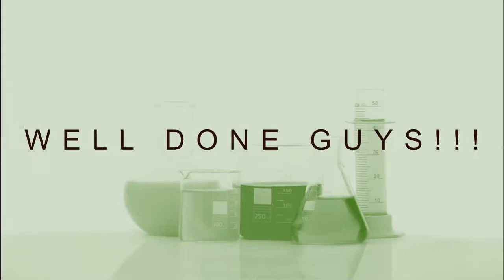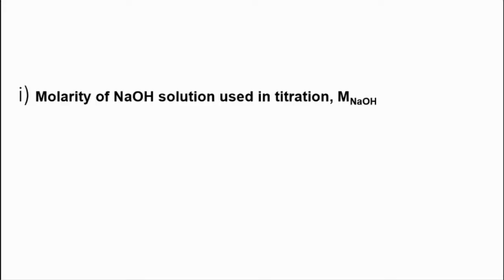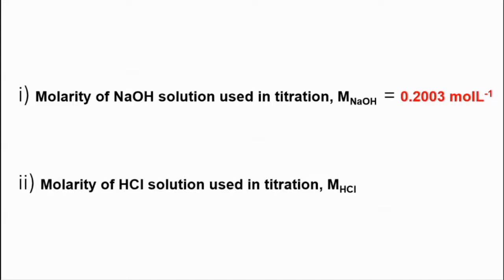As a conclusion for this experiment, the molarity of sodium hydroxide solution that we got was 0.2003 mole per liter. And lastly, the molarity of hydrochloric acid solution is 0.1924 mole per liter.